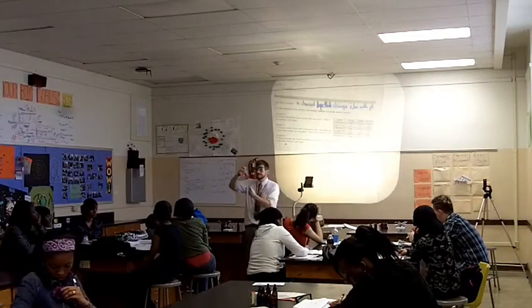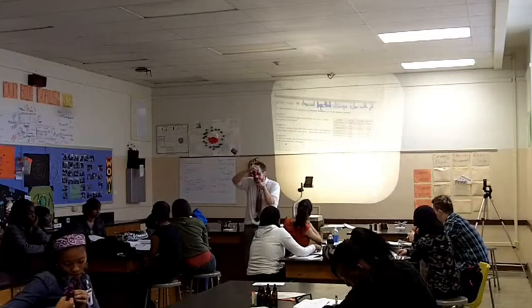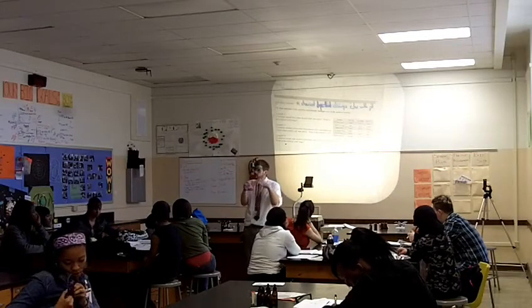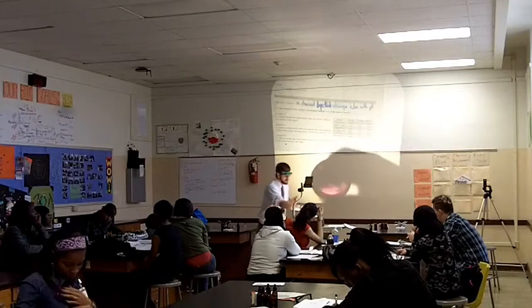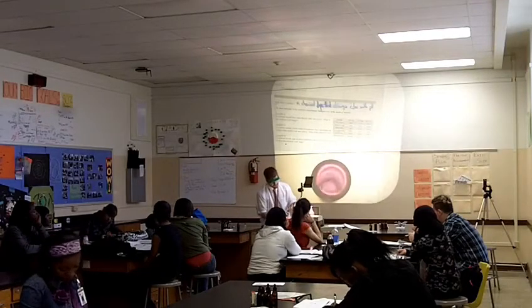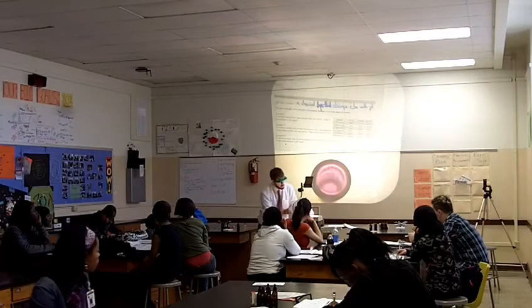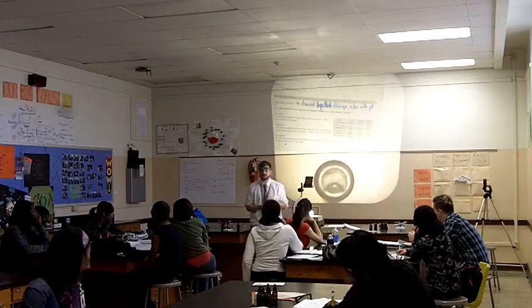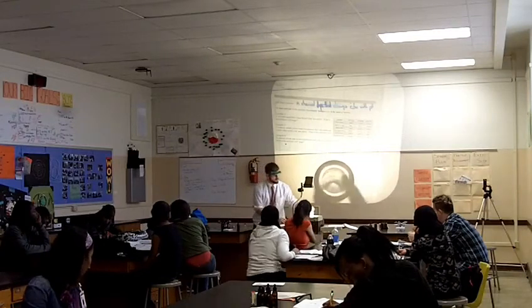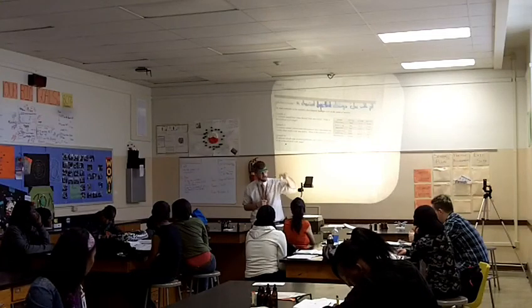Guys, this is clear and pink because I can see through it. So clear just means can you see through it? Yes, this is clear. It's clear and pink. Watch what happens when I add some acid though. If I add just a tiny drop of acid, and I swirl, then this goes back to clear and colorless. I can see through it, so it's clear, and it's colorless because there's no color.